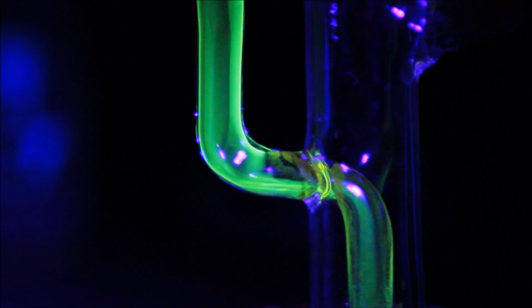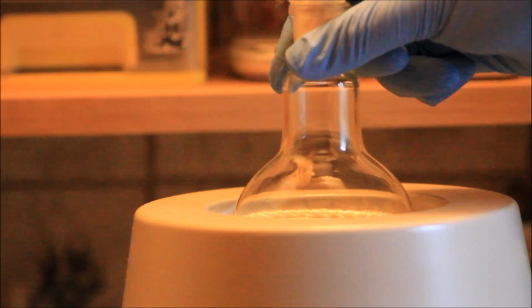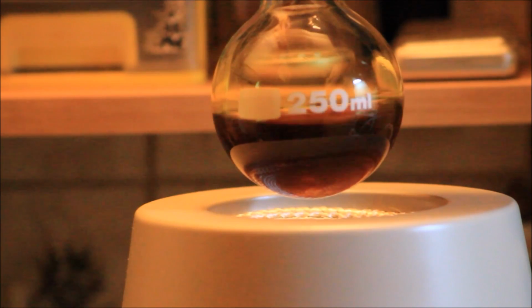Here you can see how there is a constant dripping of the solution through the siphon tube. It can also be seen how the ethanol is condensed in the first stage of the reflux condenser. Once the Soxhlet extraction is finished, the RB flask looked like this. The whole process took about 8 hours.